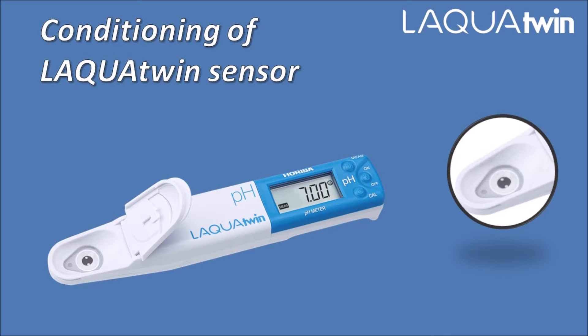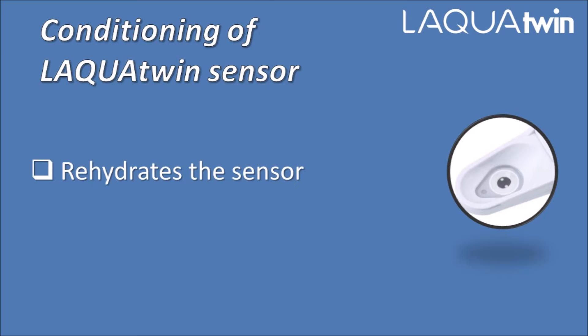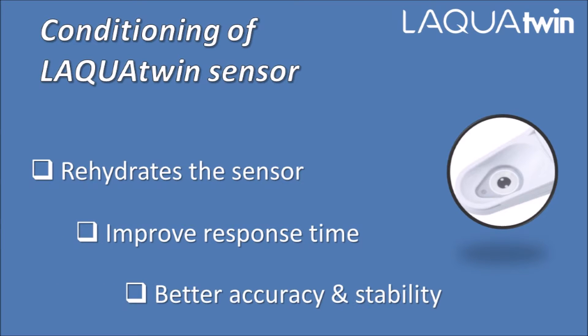Hello, welcome to Horiba Laqua Twin channel. In this video, we'd like to share an important recommendation for Horiba Laqua Twin electrode conditioning. The electrode conditioning consists of rehydrating the sensor to improve response time and sensor accuracy.